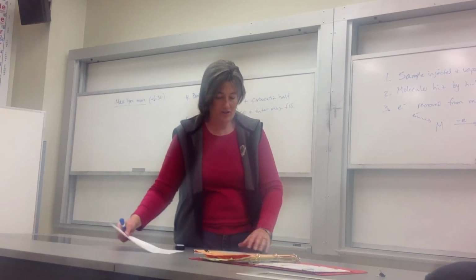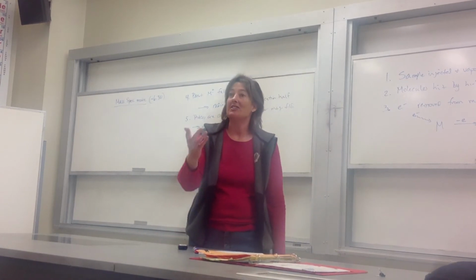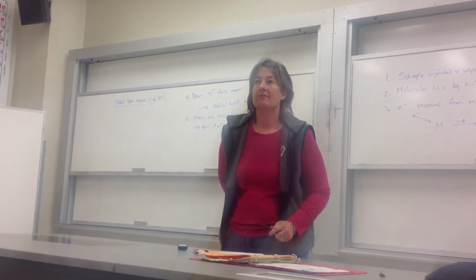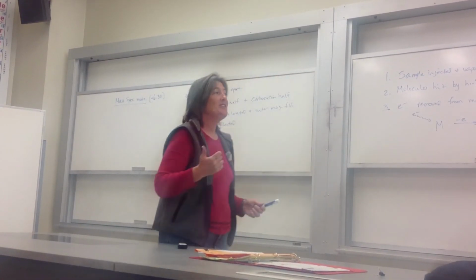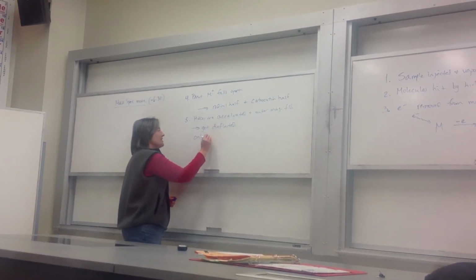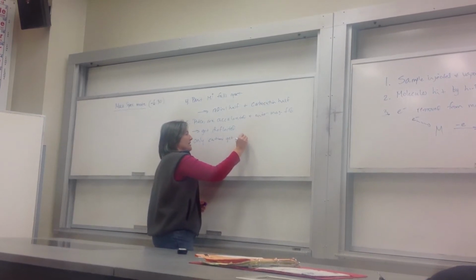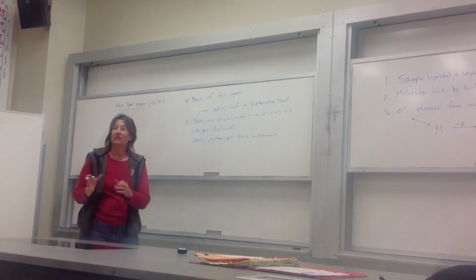As far as what is going on in their deflection, here they get sorted out by their mass. Yes? I see how you would have the ion speed up or accelerated with the magnets over there with the slits. How would you have the radical part? You don't. That's the key thing. What happens with this, and this is where things get simplified, is only the carbocations, so let's just say only the cations, get deflected. Only they get through the instrument. The radical parts don't. They don't interact with it.